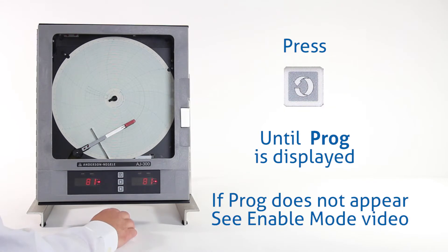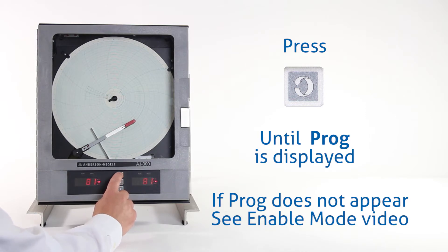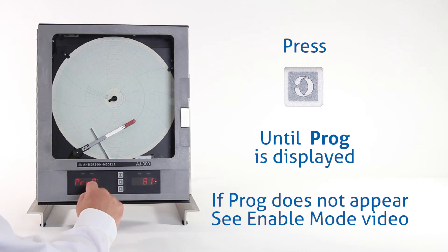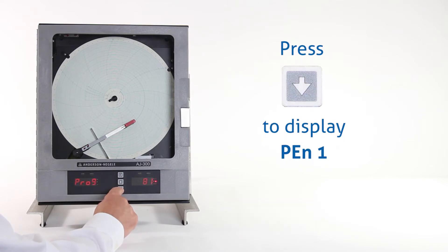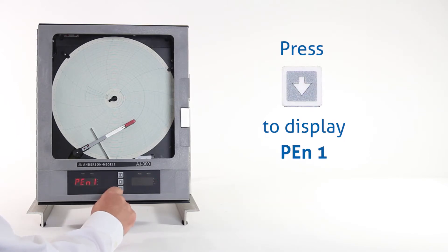To program the recorder, we first have to press the scroll key repeatedly until we see program appear on the left display. Once we have that, we'll press the down arrow key. We'll see pen 1, and we're going to do pen 1 first, so we press the down arrow key again.